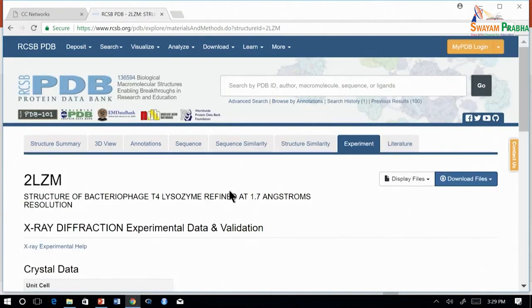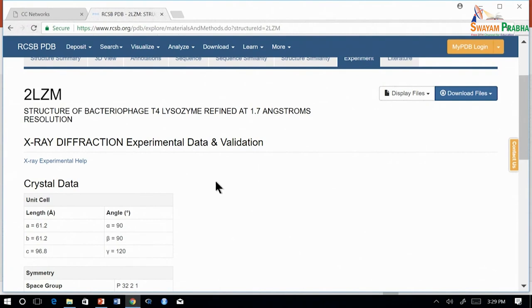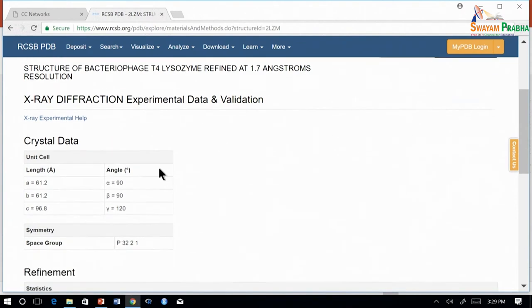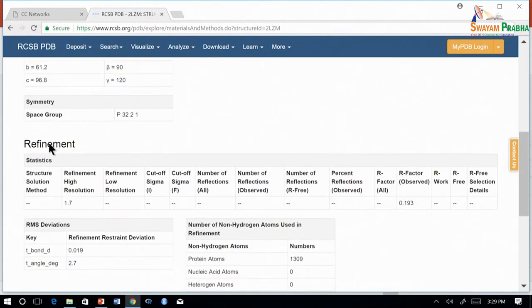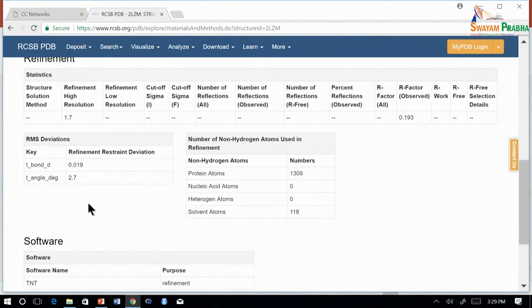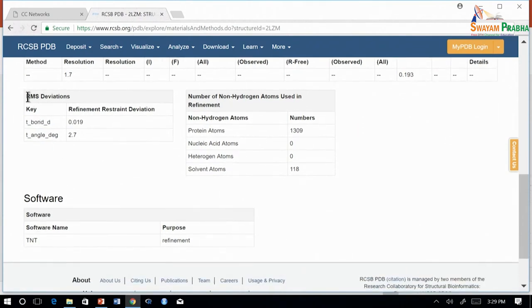Under the experiment tab you can see more metadata about the experiment which was used to get the structure. Since this is an x-ray diffraction experiment, you will find crystal data, the space group, as well as other RMS deviations and software.